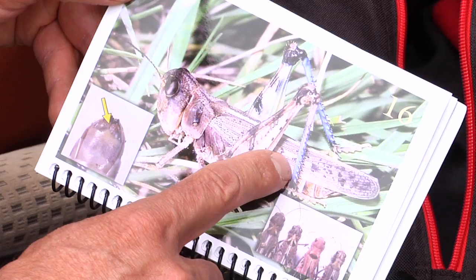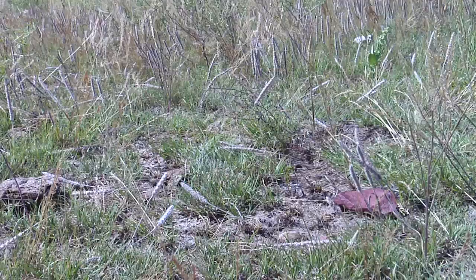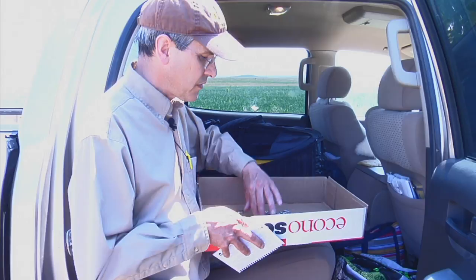They have photos with the diagnostic characters that help separate them from each other. We have over 109 species of grasshoppers in Wyoming, and probably a lot more to be discovered eventually. In this case, we are dealing with adult grasshoppers, and in our collection we only got three different species.